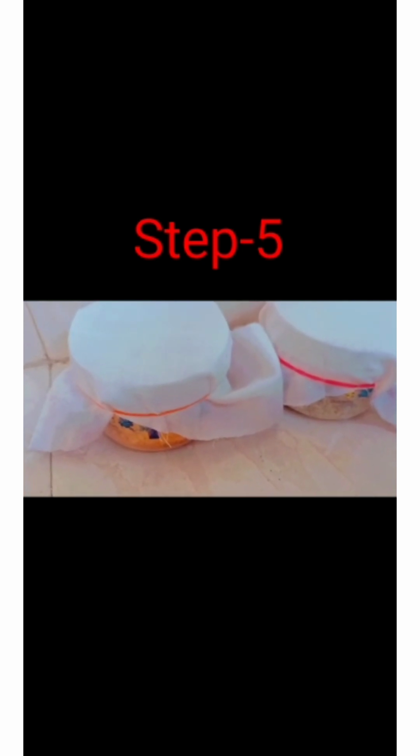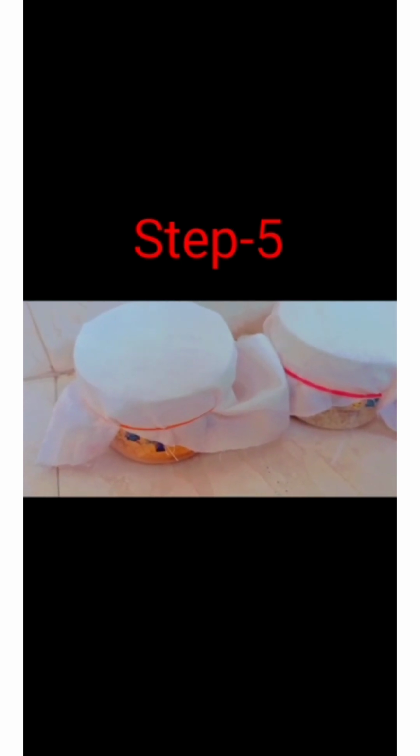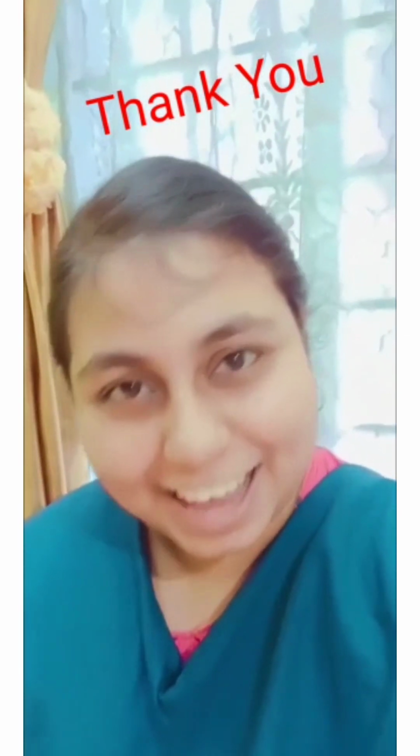Now I will keep this setup as it is for 7 days and observe the mortality rate of rice weevils after every 24 hours. Here is my setup ready. Thank you.